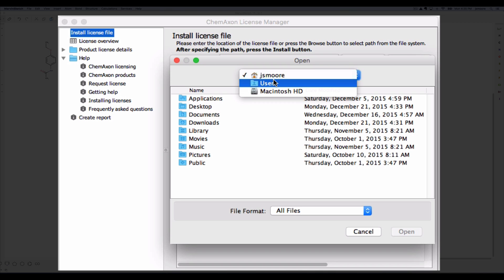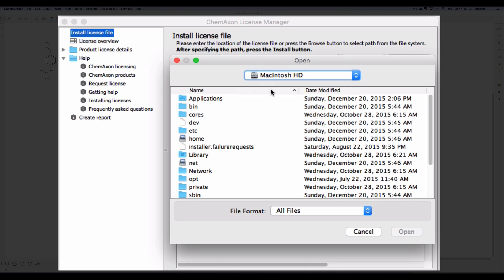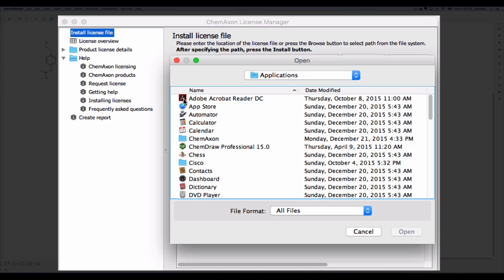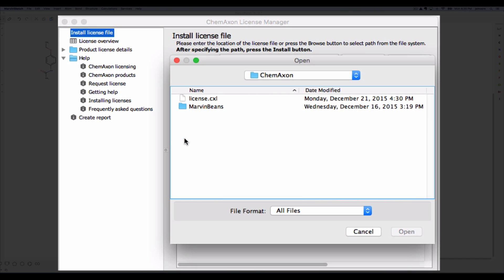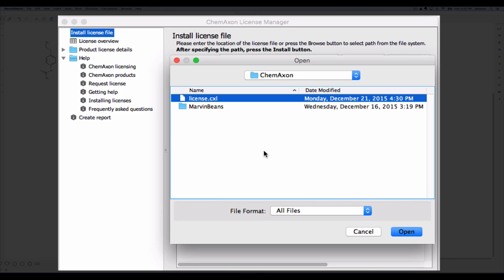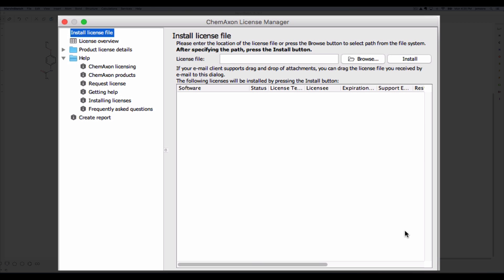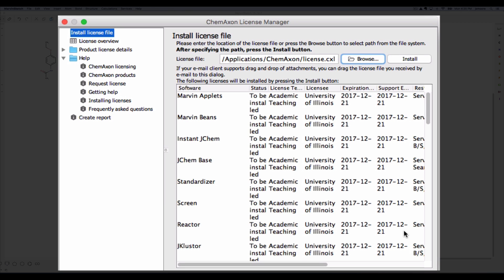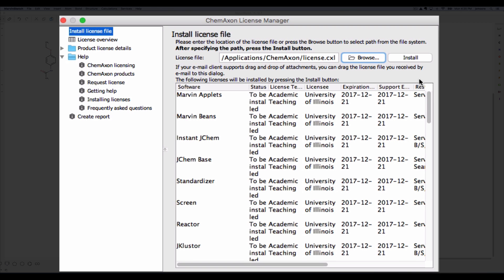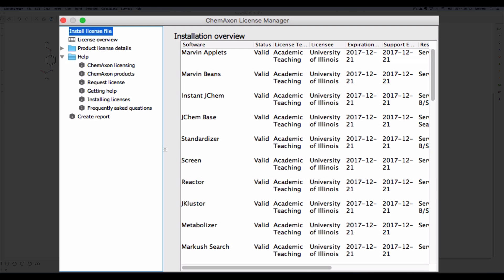On my Macintosh, the applications folder I want is just beneath the Macintosh hard drive. Open the ChemAxon folder to access the license.cxl file. Press the install button and the displayed applications will become functional on your computer.